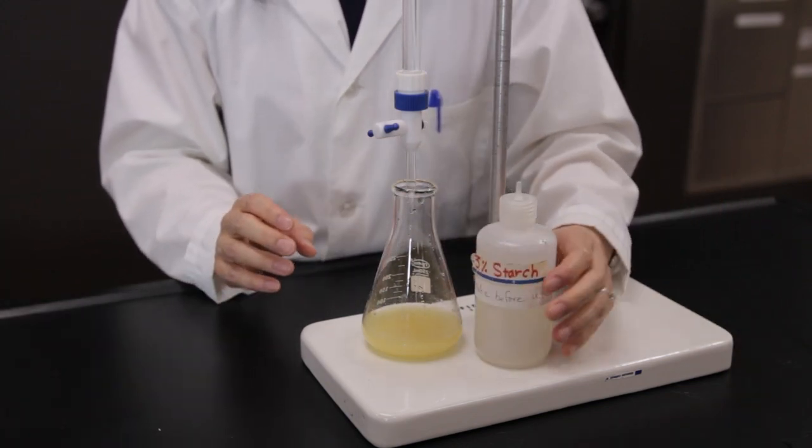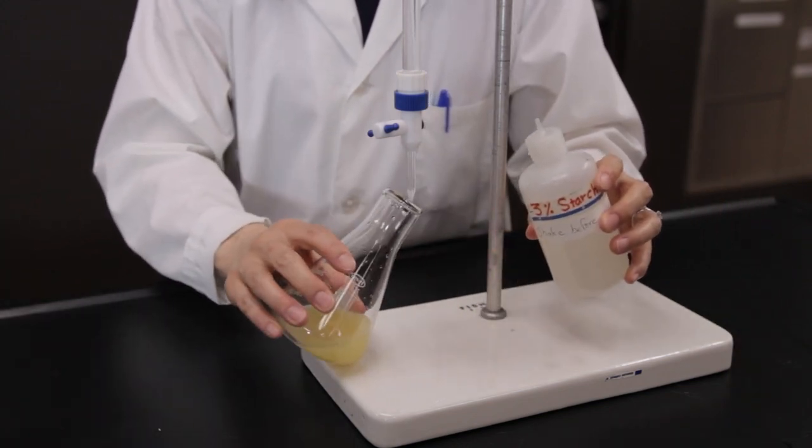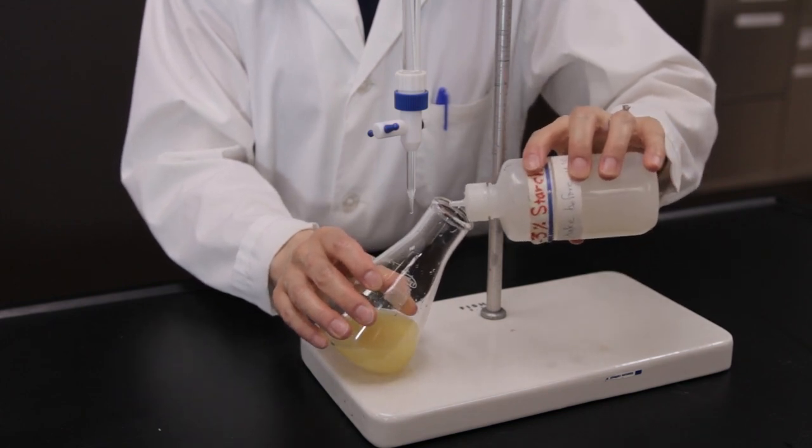When the solution color fades to a light yellow or beige, stop the titration and add about five drops of the three percent starch solution.